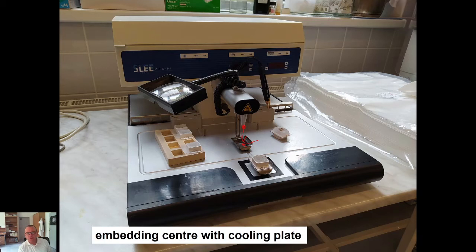The result is a tissue block, which is then cooled by a cooling plate. Of course, it must also be labeled by the number of the specimen, and the result after total cooling and so hardening is a paraffin block, where we can see some pieces of tissue in the big block of wax. Molds can be metal or plastic, it depends on the laboratory.